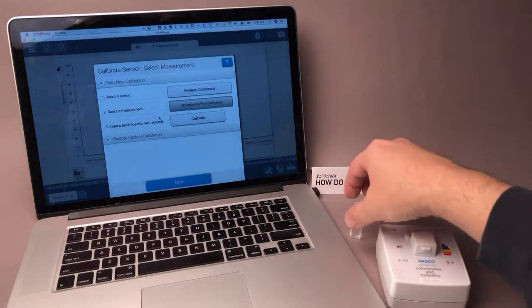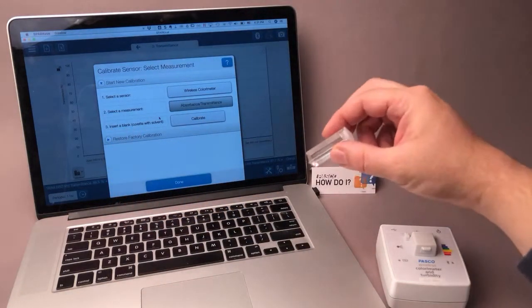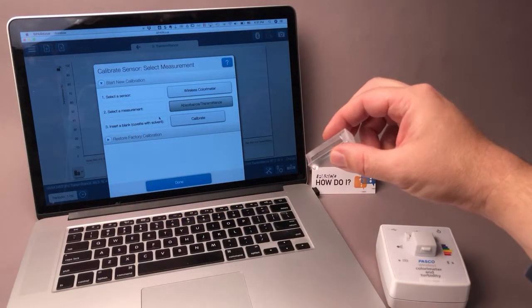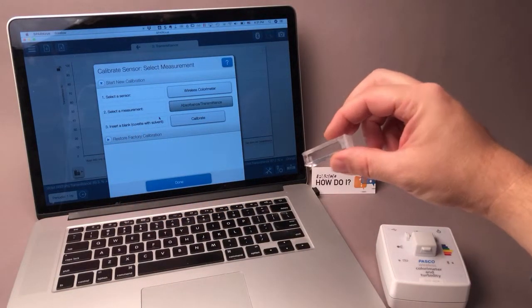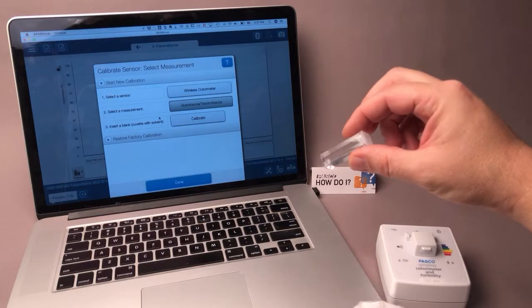And I need to insert a blank cuvette with the solvent I'll be using. In this case, I'll be using distilled water.